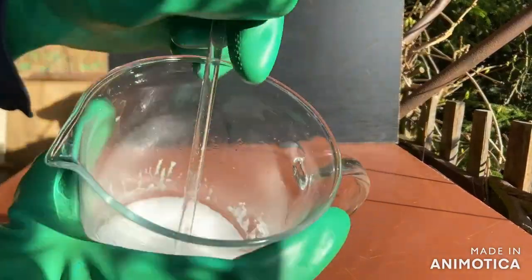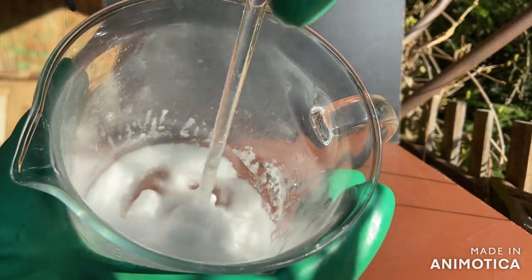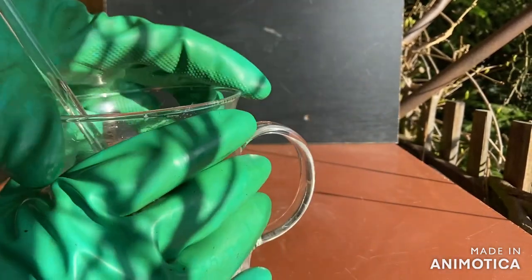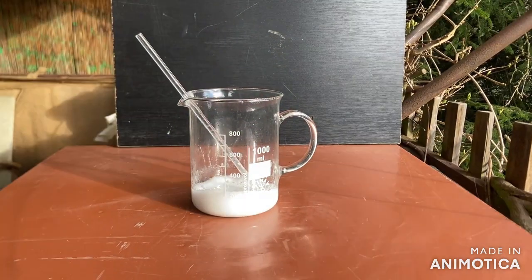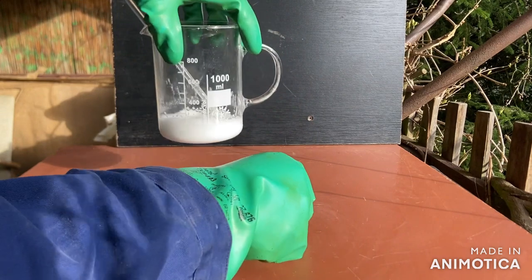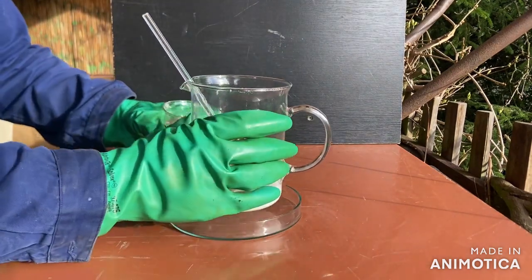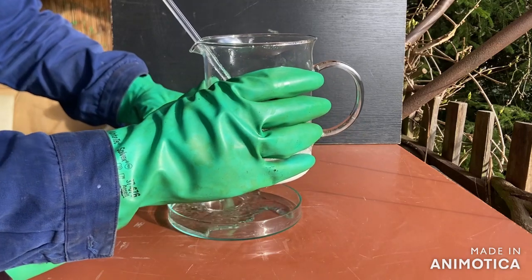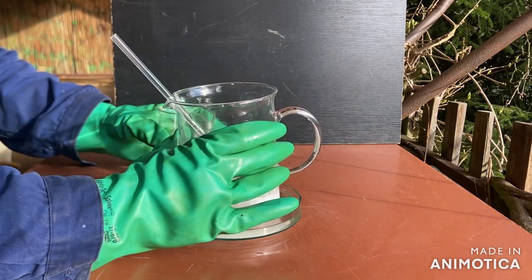After cooling down to room temperature, the solution basically turned into ammonium chloride mud. I decided to cool it down even more so more ammonium chloride will precipitate. I put the beaker into a petri dish, poured water into the dish, and then put reusable ice cubes into the water.